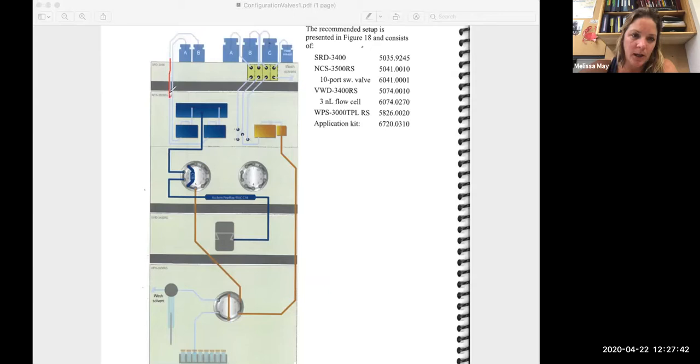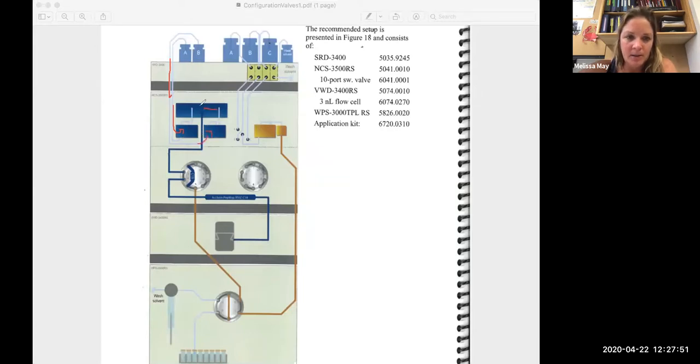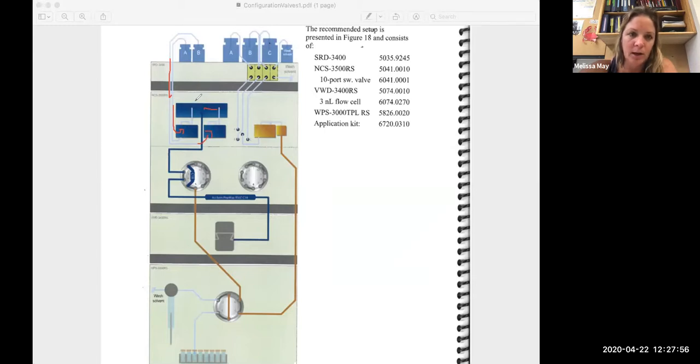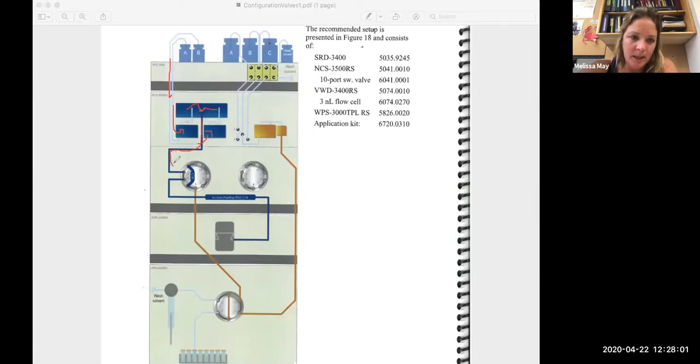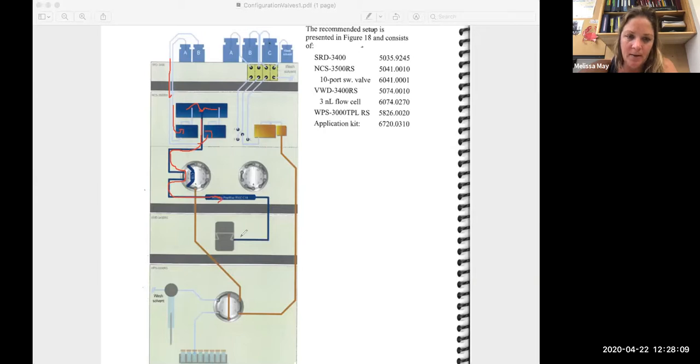So you have solvent A and solvent B that are going to come into their various blocks. Those are going to get mixed together in this flow meter, and they're going to come down and in the one-two position flow directly onto the column and then get sent out to the mass spec.